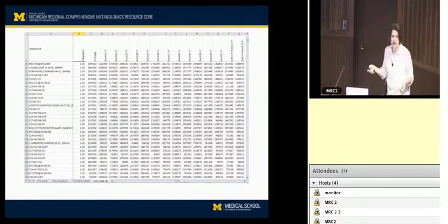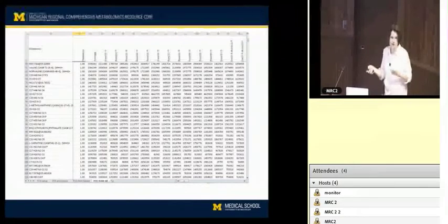Sub mentioned that when he did his analysis, they really focused down on the named compounds. For various reasons, they did not want to deal with the unknowns. Maybe they didn't want to find biomarkers that they later needed to dig in and figure out what they were.